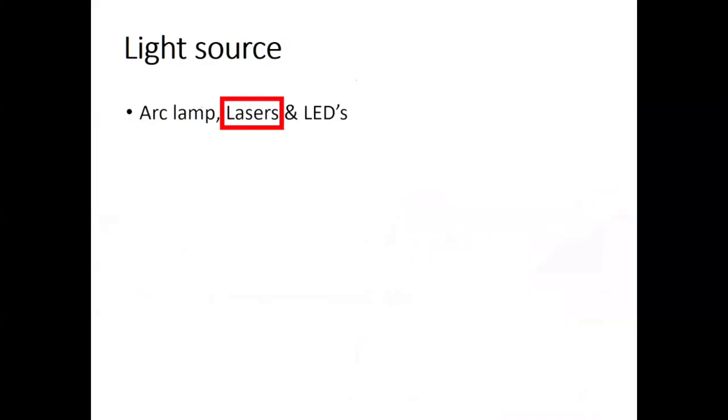Why do you want to use laser specifically? Why not regular LEDs or halogen lamps or any other light source? Why specifically laser? Because laser has some beautiful properties. Everyone has played with a laser, right? I feel everyone during our childhood would have tried using lasers for multiple reasons. I'm not going into that.